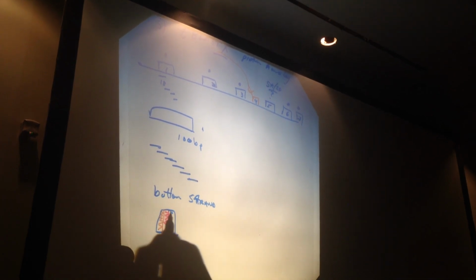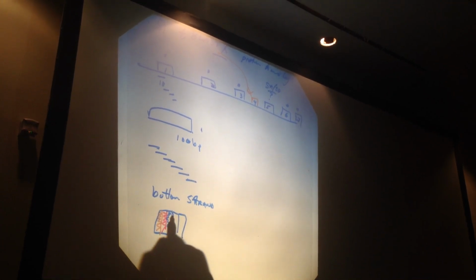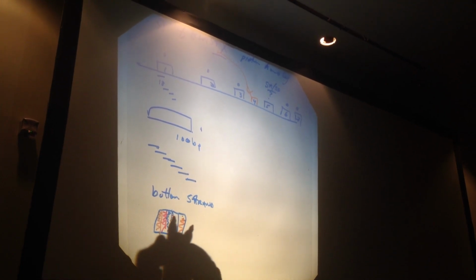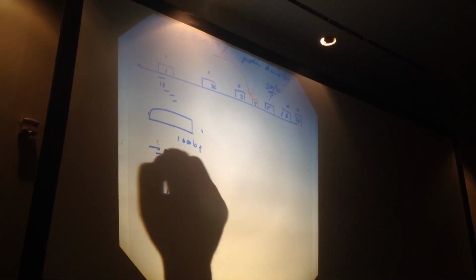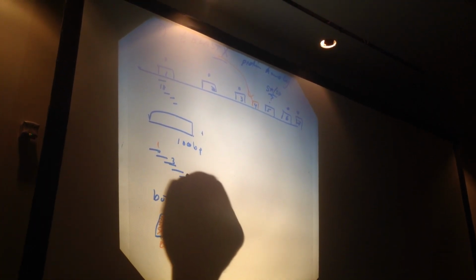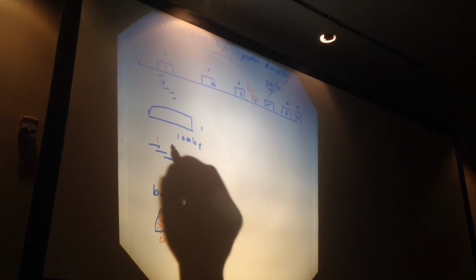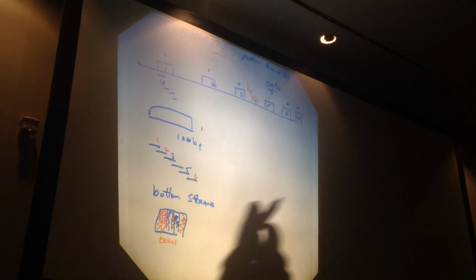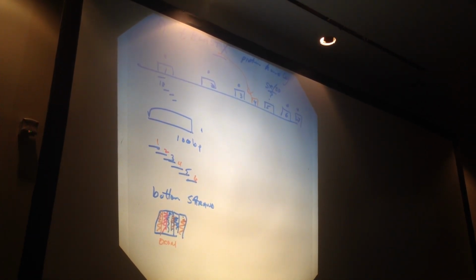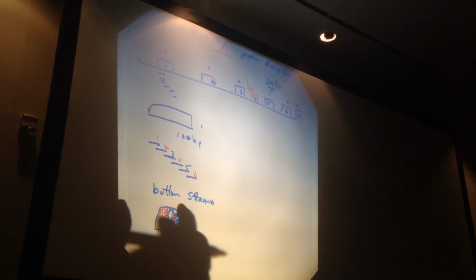This compartment here is oligo 3, etc. I'll have to draw more spaces. 4, 5, 6. 6 oligos, all bottom strand oligos, all in one place in the chip.